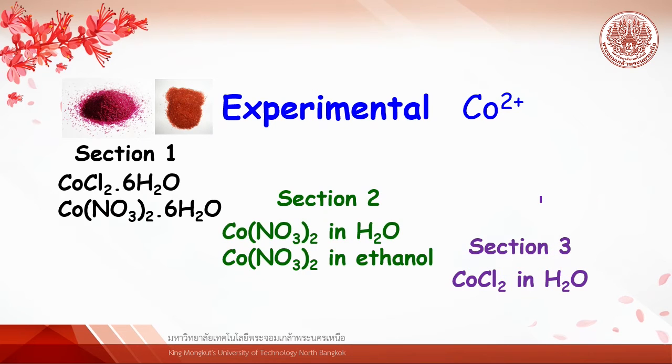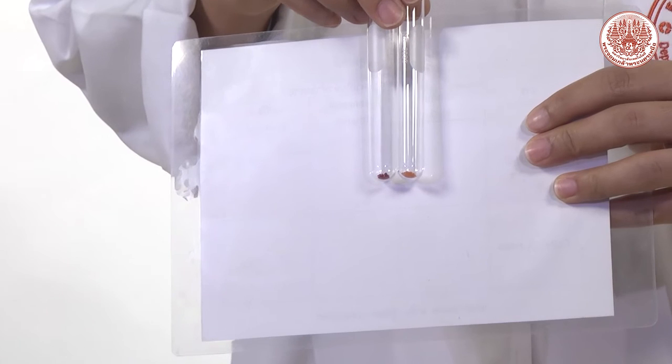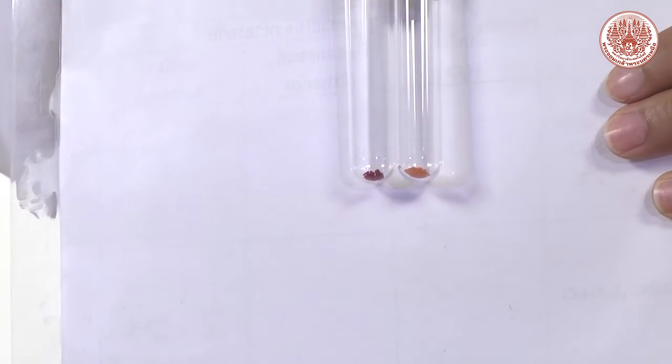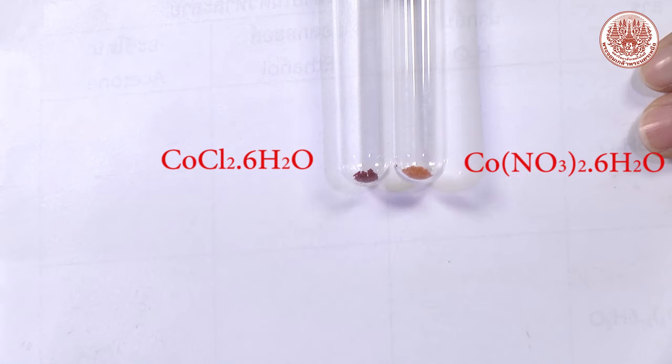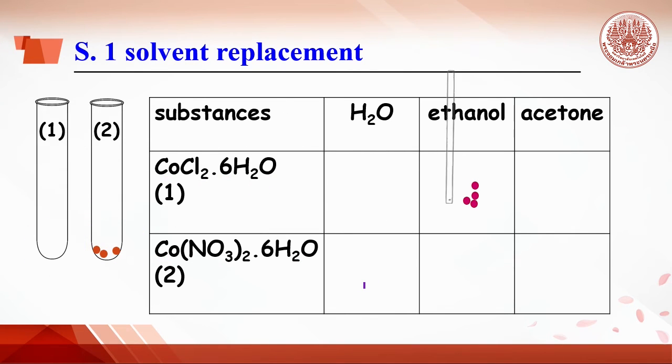However, today we use many types of cobalt solutions. So please look more carefully before doing the experiment. Section 1: Observe the crystal of cobalt chloride hexahydrate and cobalt nitrate hexahydrate. After that, pour the cobalt chloride on the plastic sheet and use stirring rod. Separate the crystal into three parts. Do the same for cobalt nitrate hexahydrate.